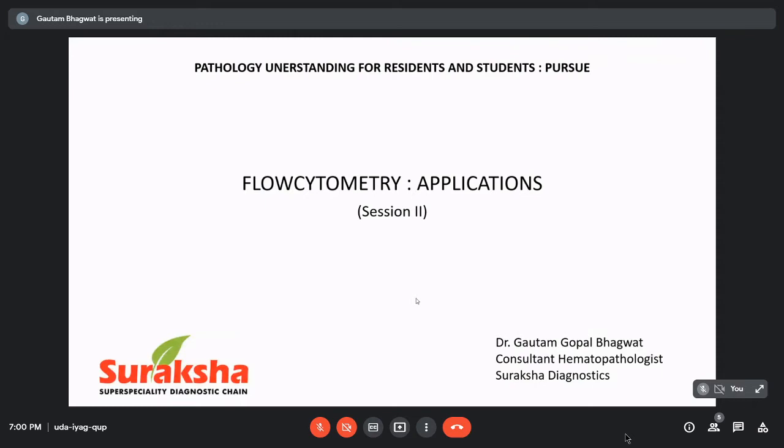I am really thankful to you for giving me this opportunity to talk on one of my favorite subjects in hematology, that is flow cytometry. This is my third talk, as sir mentioned, of this series. In the first talk, I had talked about the principles and techniques of the flow cytometry machine. We had dealt with the workflow of a flow cytometry lab, then what is the fluidics, optics, electronics. I had explained about fluorescence and the need of multicolor flow cytometers, and we had discussed the challenges in terms of compensation that we face with multicolor flow cytometry. We had also discussed a bit about quality control in flow cytometry and automation.